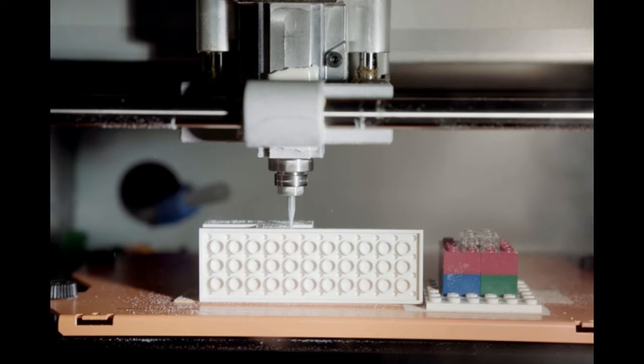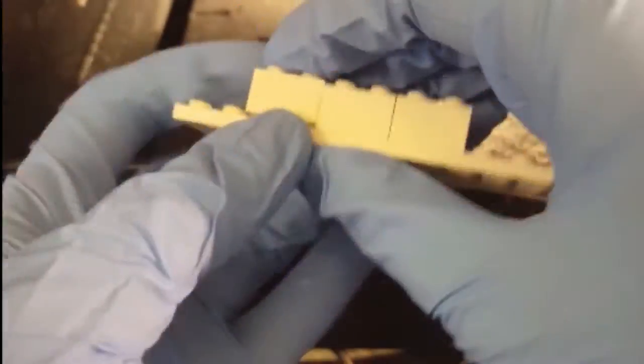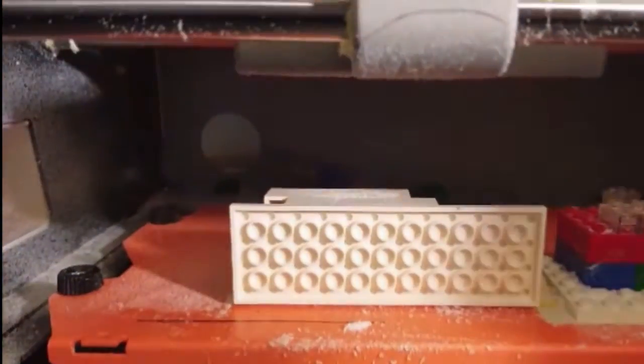The researchers used a desktop micromilling machine to drill small channels into the sidewalls of Lego bricks.